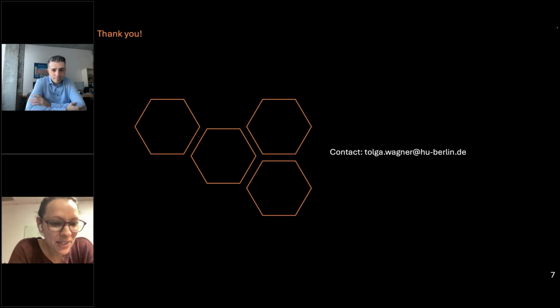Okay. So the first one here, dear Dr. Tolga, how much voltage and current did you use to thin the lamella when you finally processed it so that it could reach nanometer thickness? And how much thickness did you cut off at that time?